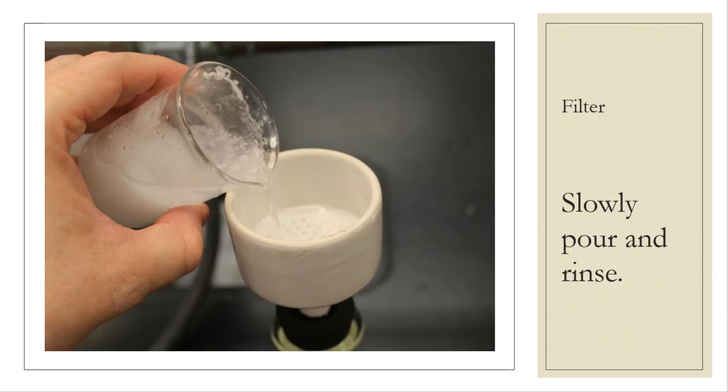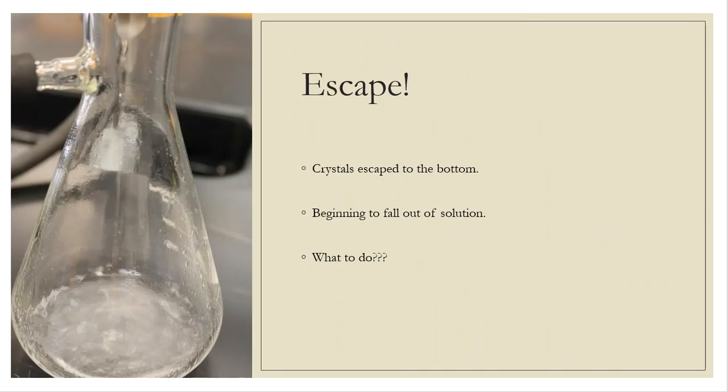So I'm going to slowly pour that clathrate through the funnel. I don't want to dump it in all at once. I have the tendency, if I go too quick, to stop up the holes, and then it takes forever for it to filter through, and I just don't want that to happen. All right, so then I begin to see a problem.